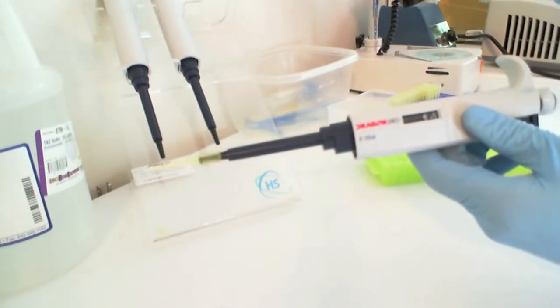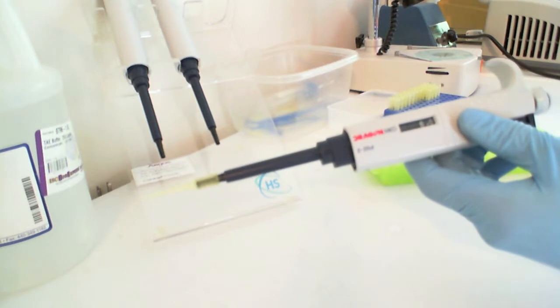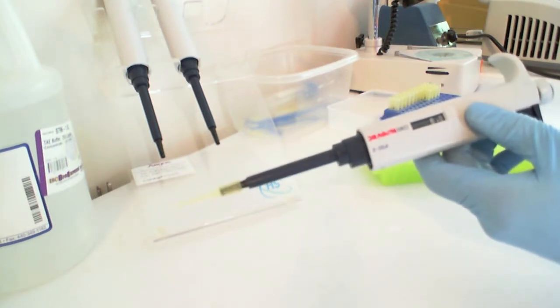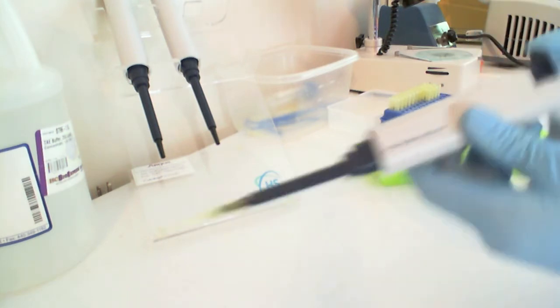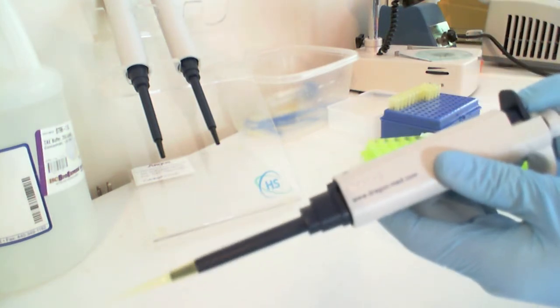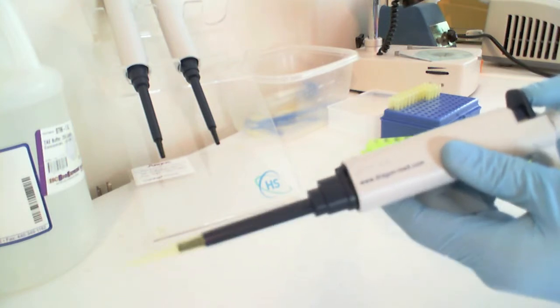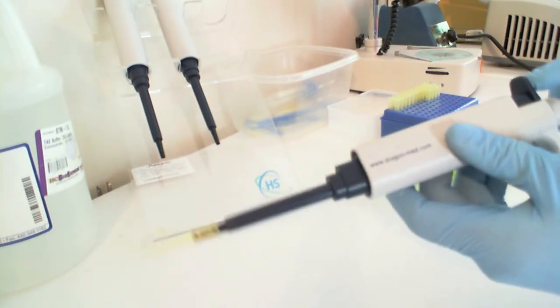When you're done using one reagent, you'll need to eject the disposable tip on the end of your pipette and replace it with a new one. Tips are ejected by pressing this button at the back end of the pipette, which moves a barrel down, pushing the tip off the end.